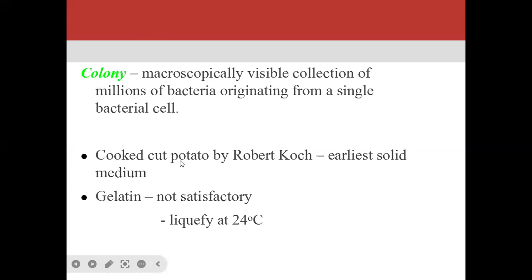And cooked cut potato medium is the earliest solid medium, which was prepared by the scientist Robert Koch. In the preparation of this solid medium, initially they used gelatin, but gelatin is not satisfactory because gelatin liquefies at room temperature. That is, gelatin liquefies at 24 degrees centigrade. So that's why gelatin is not satisfactory.